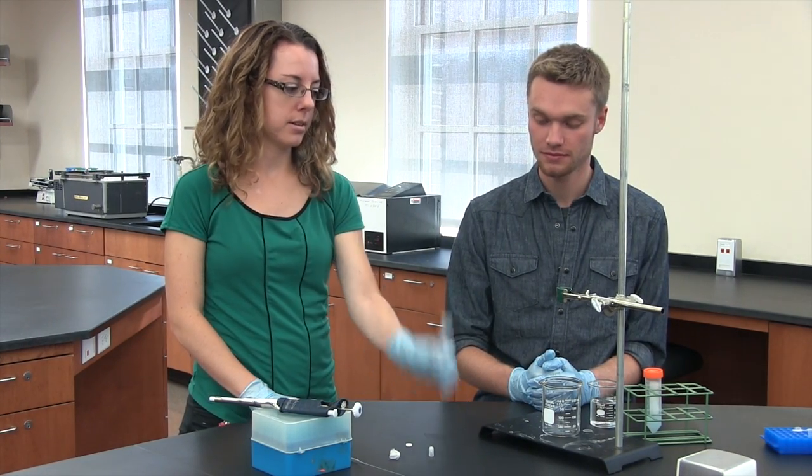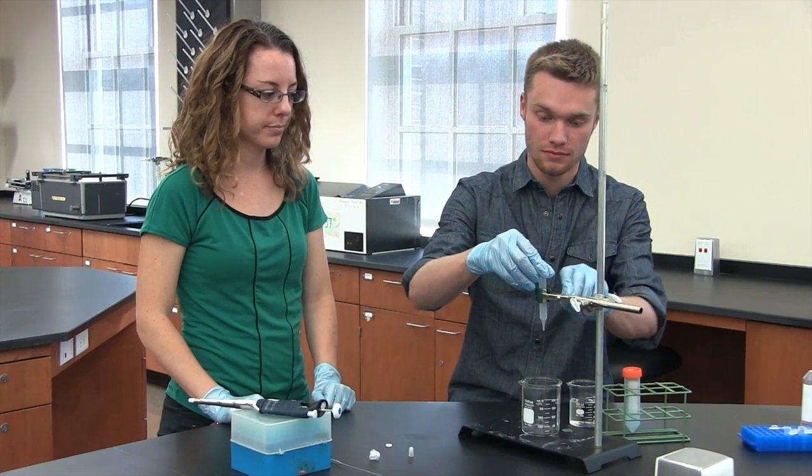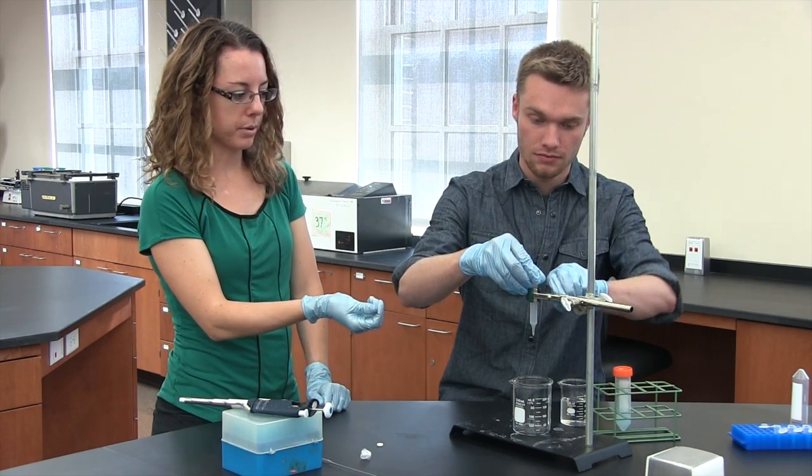The first thing you need is the empty plastic column. You can put that into the clamp and then put the cap on the bottom.